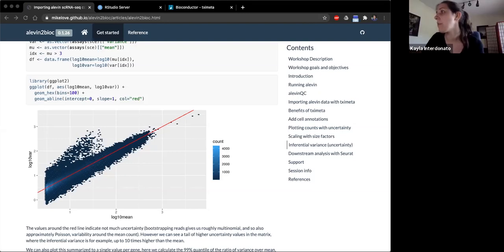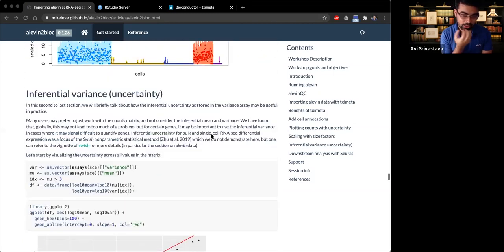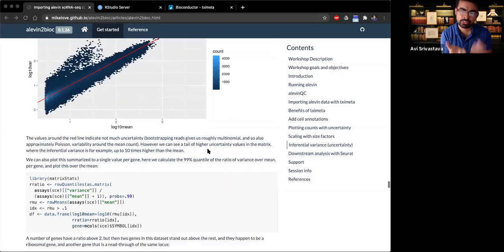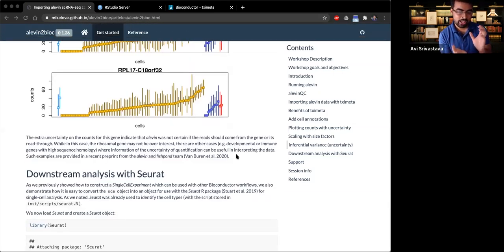Are the multi-mapping reads taken care of as RSEM does in bulk RNA-seq? What is the optimum bootstrap value? I guess there are two different questions, right? So the first one, I guess, is asking whether multi-mapping reads are somehow related to TPMs in bulk RNA sequencing, if I'm understanding correctly. I would say here 3' sequencing is actually an absolute count. It's not a relative count.